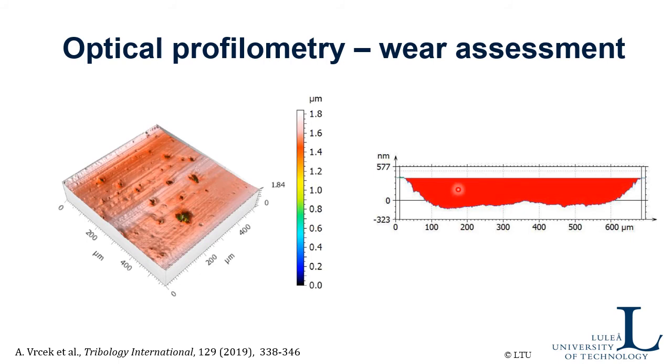So one way to do it is to use optical profilometry to measure the amount of wear. Another way to do it is to weigh the sample before and after. That's maybe the traditional way to do it, but this is a more exact way, because sometimes the wear is so small that it's very difficult to see the difference in weight before and after.